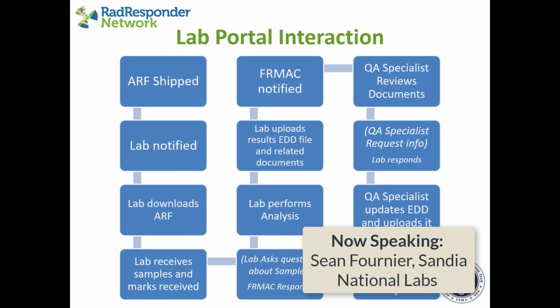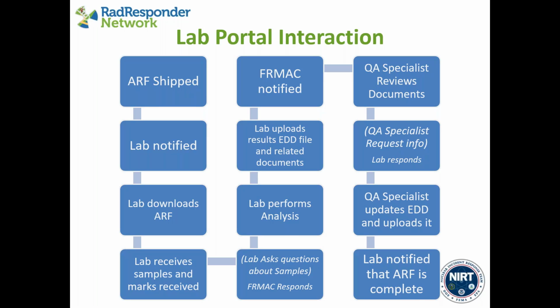Today we're going to pick up where we left off in part 1. We showed you the new sample workflow, how to make mixtures, establish your analysis instructions, and develop your analysis request forms. Today we're going to take the perspective of the responding laboratory that receives the analysis request form and the samples, performs the analysis, and posts their data to RadResponder in the new lab portal.